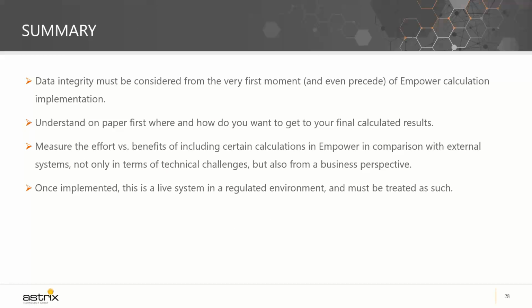So to summarize this presentation, we wanted to leave you with those final thoughts. Data integrity must be considered from the very first moment and even precede the Empower calculation implementation. If you get your data integrity requirements evaluated upfront, from the config spec of your system up to the way you are ready to build the validations, that's the best way to go in terms of implementation of calculations, right? Always have data integrity from the get-go.